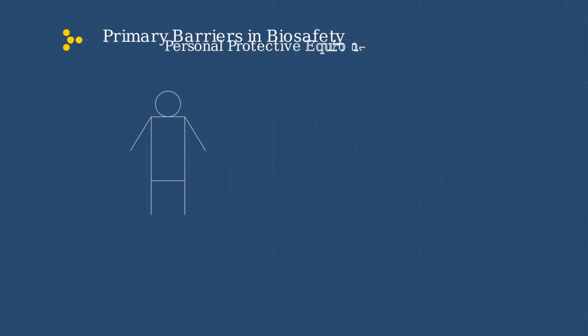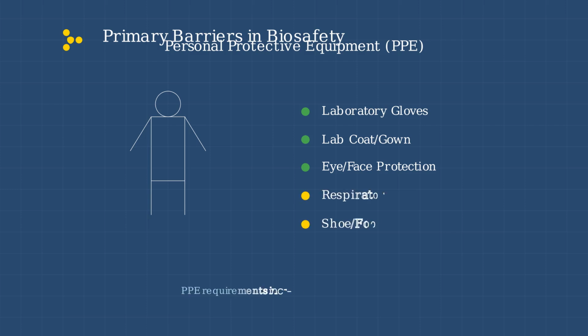Personal protective equipment forms an essential barrier between laboratory workers and biological hazards. Basic PPE includes laboratory gloves, lab coats, and eye protection. Higher biosafety levels require additional items like respiratory protection and dedicated footwear.